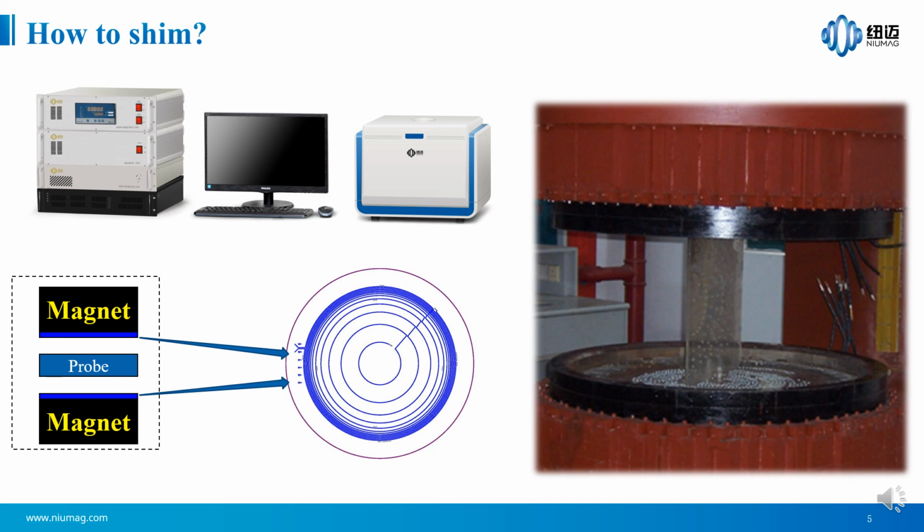The corresponding structure of our device is as follows. Each magnetic pole has a gradient plate, and each gradient plate corresponds to the gradient coils in the X, Y, Z three directions. We can modify the current magnitude and direction of the X, Y, Z gradients directly in the software, and we will see that later in the demo.